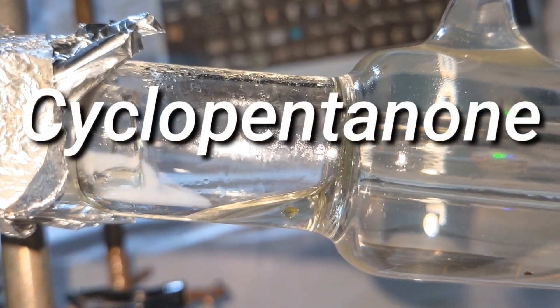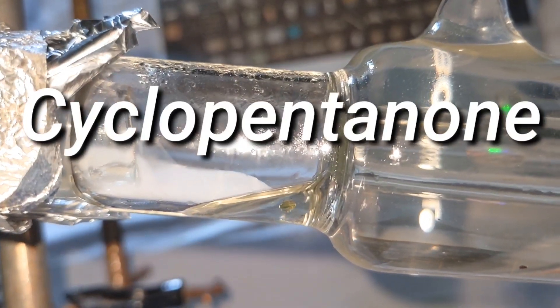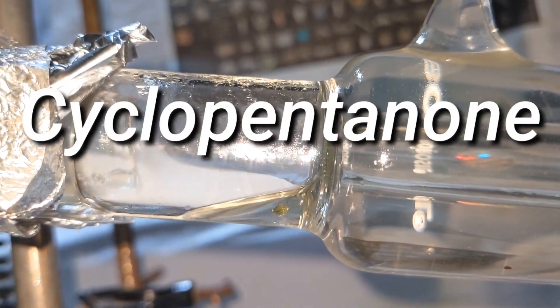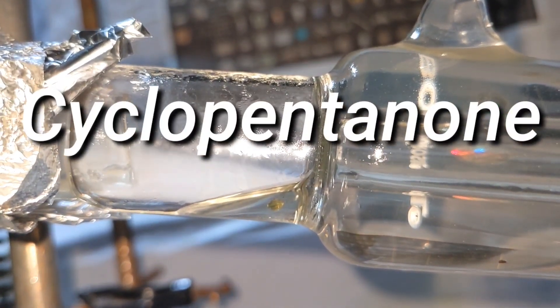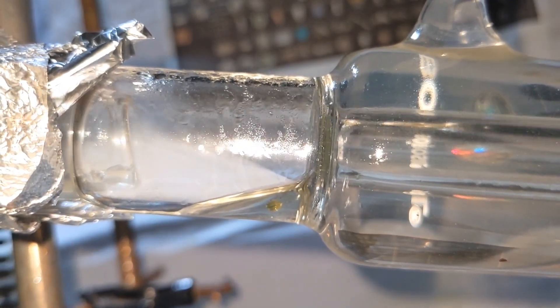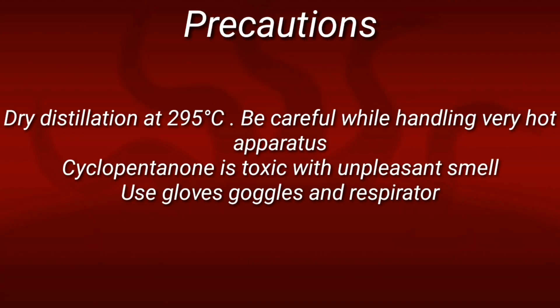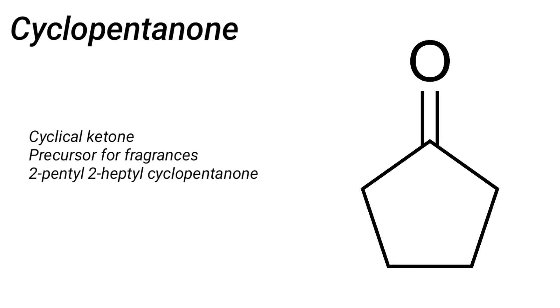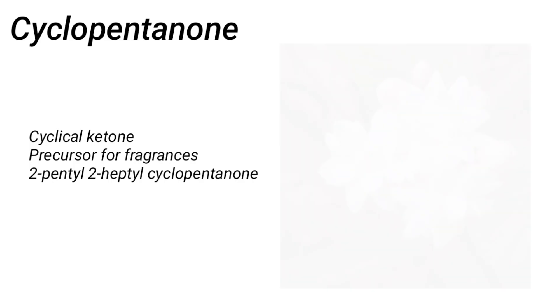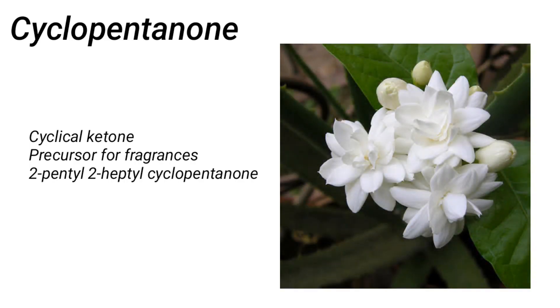In this video we make cyclopentanone by the dry distillation of adipic acid. Cyclopentanone is a cyclic ketone — a colorless, volatile liquid and a common precursor to fragrances like jasmine, which contain two-pentyl or two-heptyl cyclopentanone.